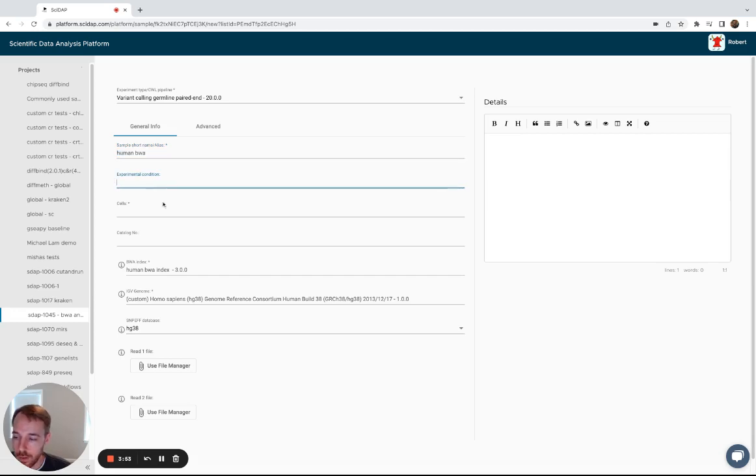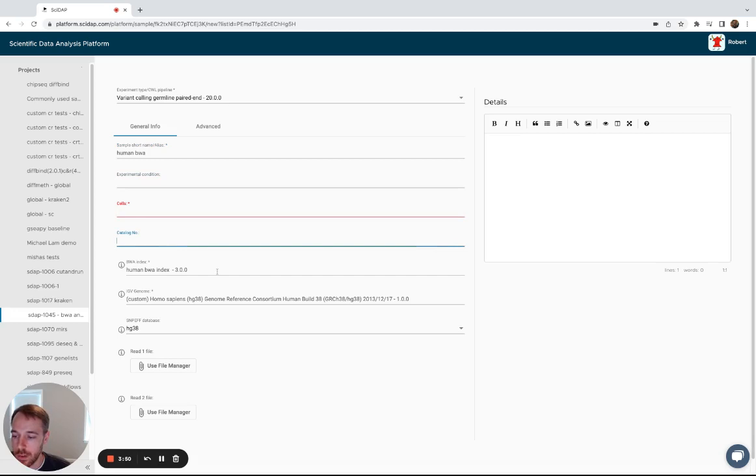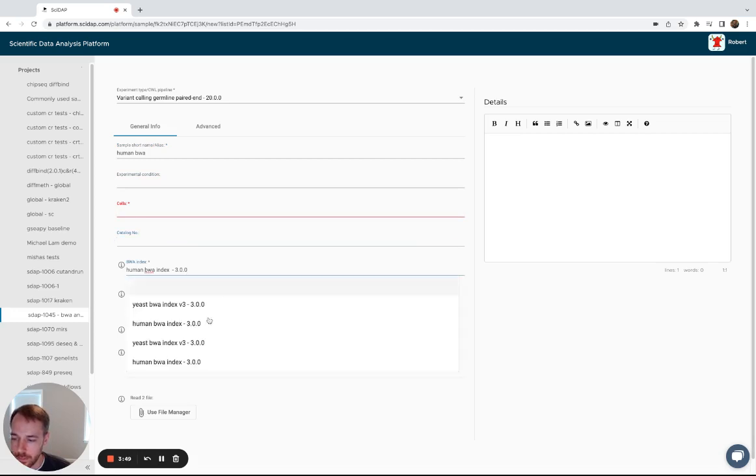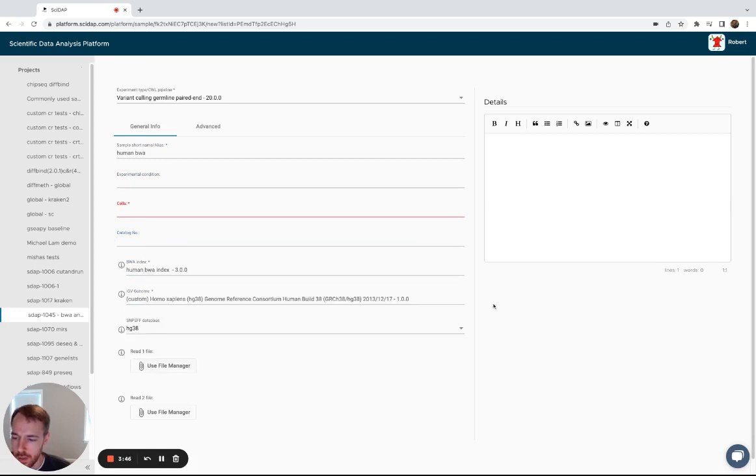Add experimental condition, cell type, catalog number if it's available, select that BWA index sample that you just made.